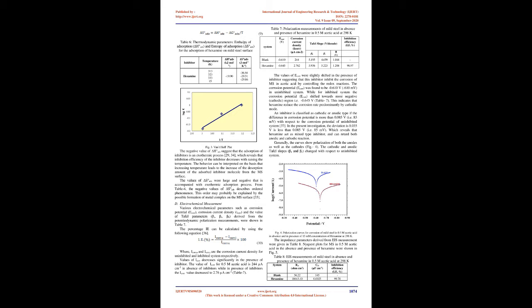Initially open circuit potential, OCP, was measured as a function of time, and after the stabilization of the electrode at OCP, the electrochemical measurements were carried out. The change in potential was measured by a potentiostat, CH Instruments model CHI 608C, made in USA. EIS was carried out in the frequency range 1 to 100 kHz and AC amplitude of 5.0 mV. A graph was drawn by plotting real impedance, Z', versus imaginary impedance, Z''. The typical Nyquist plots of MS were obtained in the absence and presence of the inhibitor in acetic acid solution.